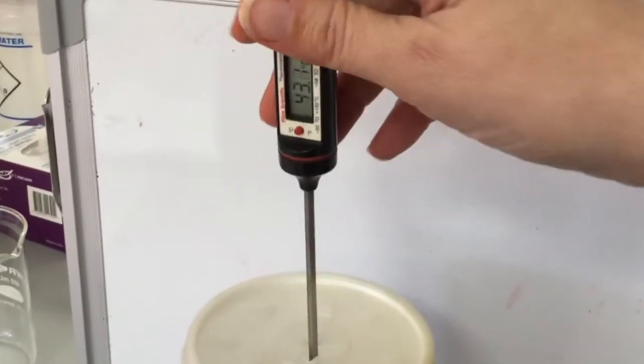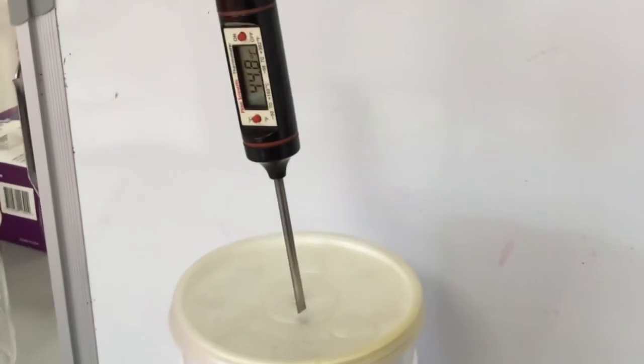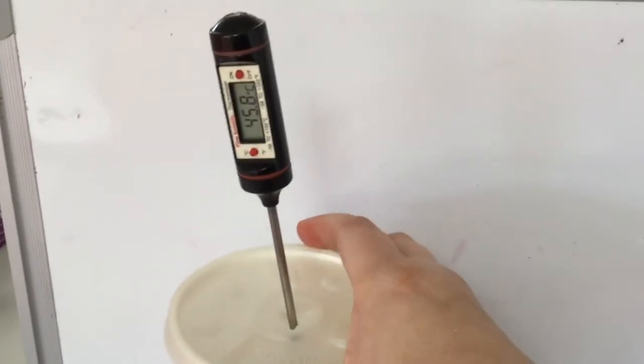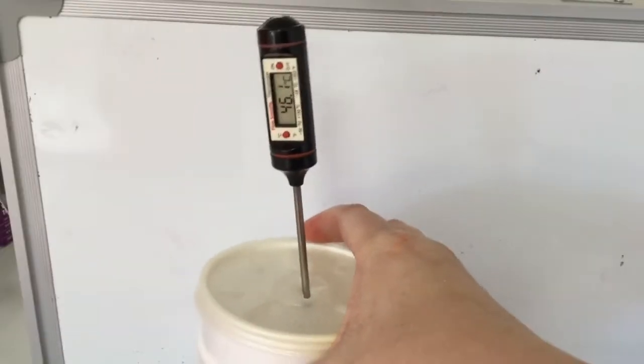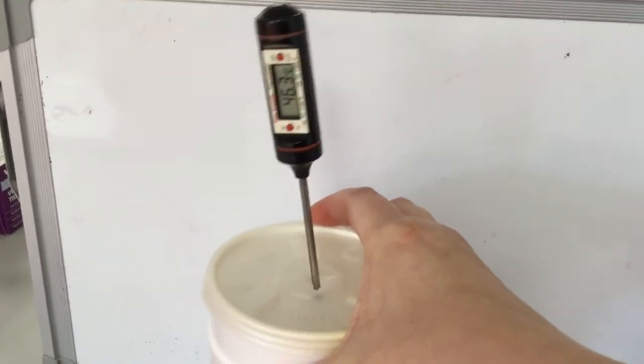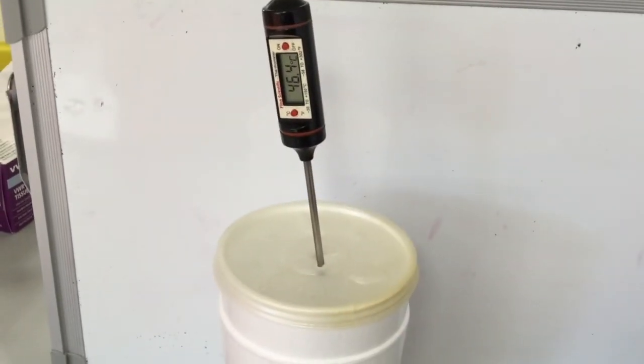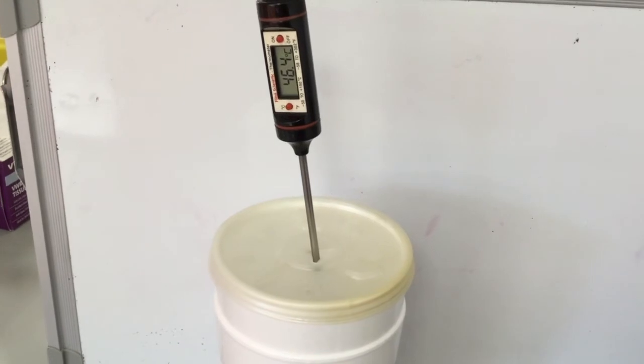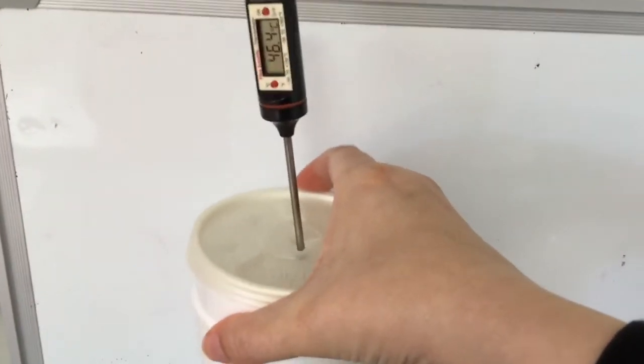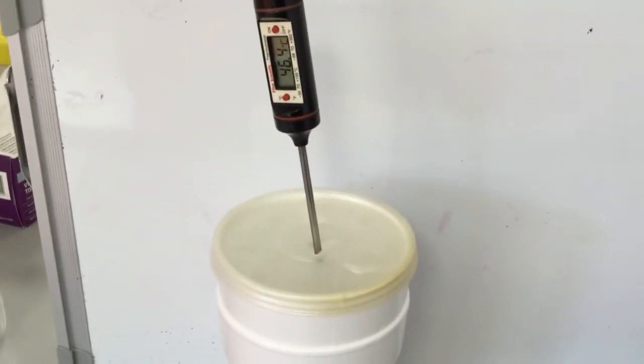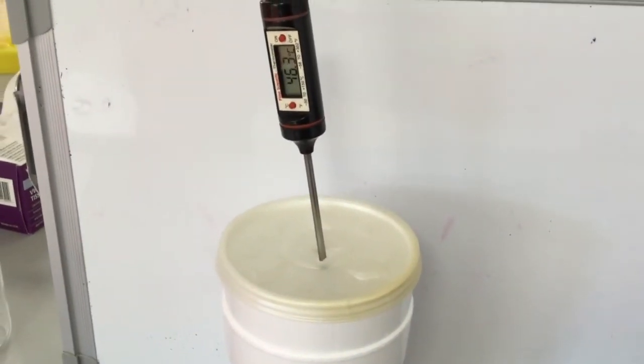Once you have recorded the temperature of your hot water, you're going to pour the hot water into the cold water and immediately replace the lid. Insert the thermometer and begin watching the temperature. We are looking for the highest point that the temperature reaches. This may take up to a minute. So make sure that you continue watching until the temperature starts to fall.